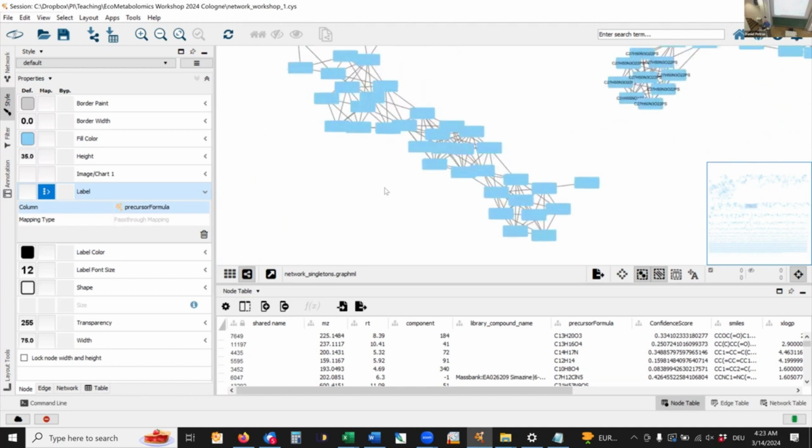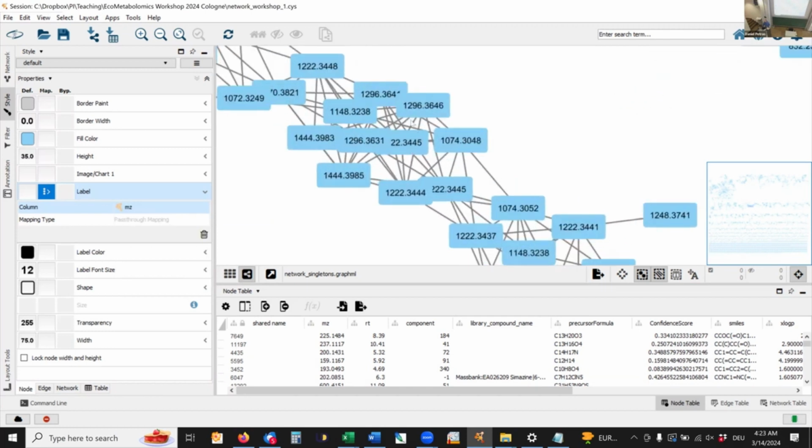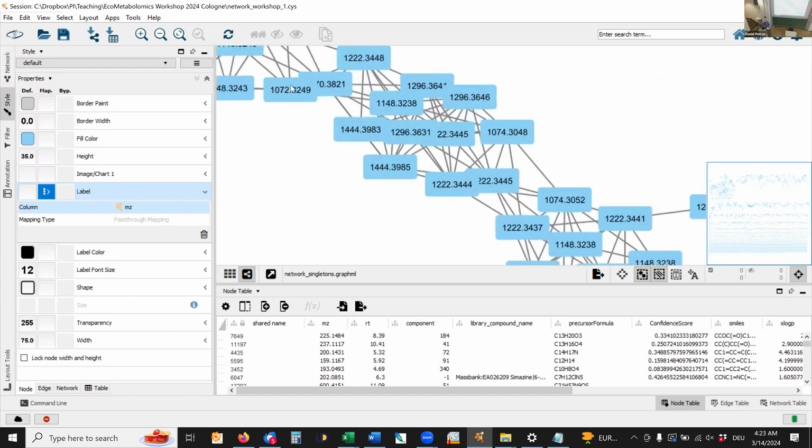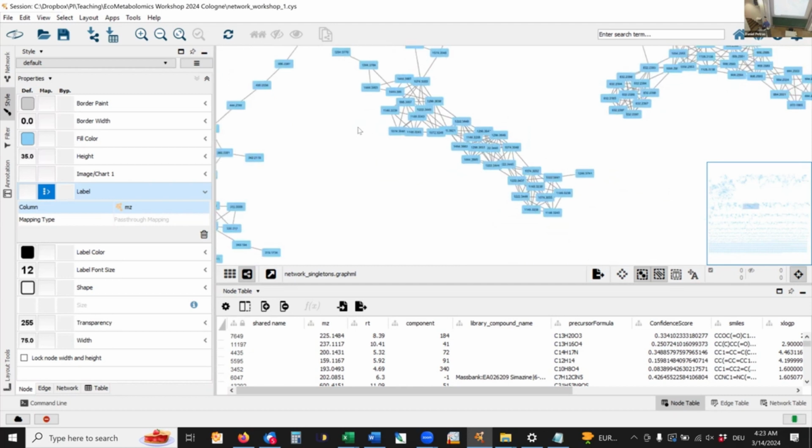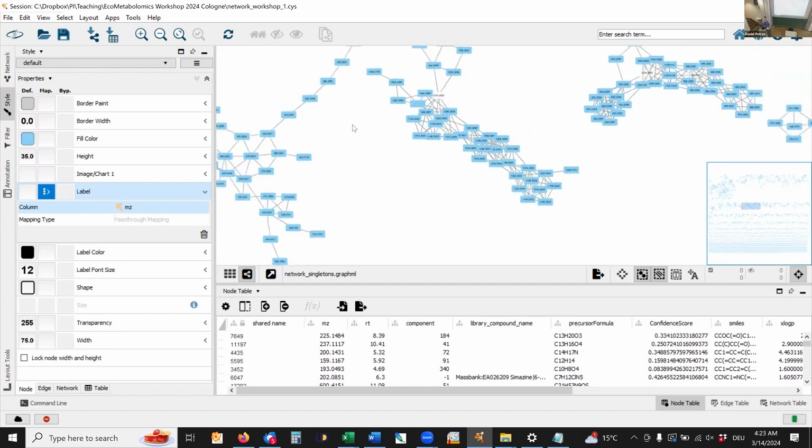Marcus just mentioned that he cut the molecular formula annotation at 900 Thomson, so at 900 m/z. So they may just be bigger compounds. We can of course quickly check this by switching to m/z, and then surprise, surprise, maybe it's not that new stuff, but just larger molecules that were not considered in SIRIUS due to computational constraints for larger compounds. Okay, so now there are of course other layers of information.